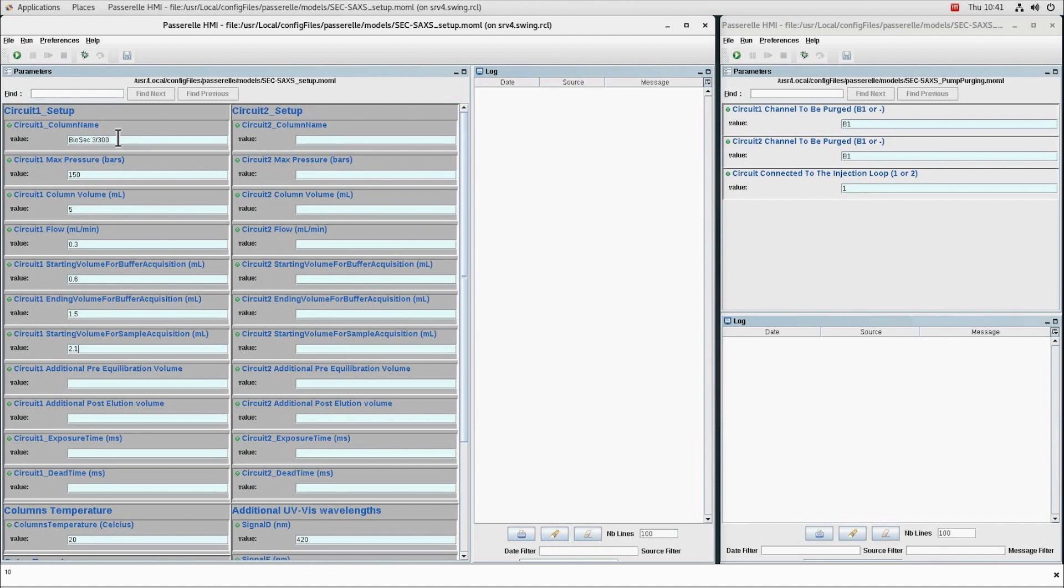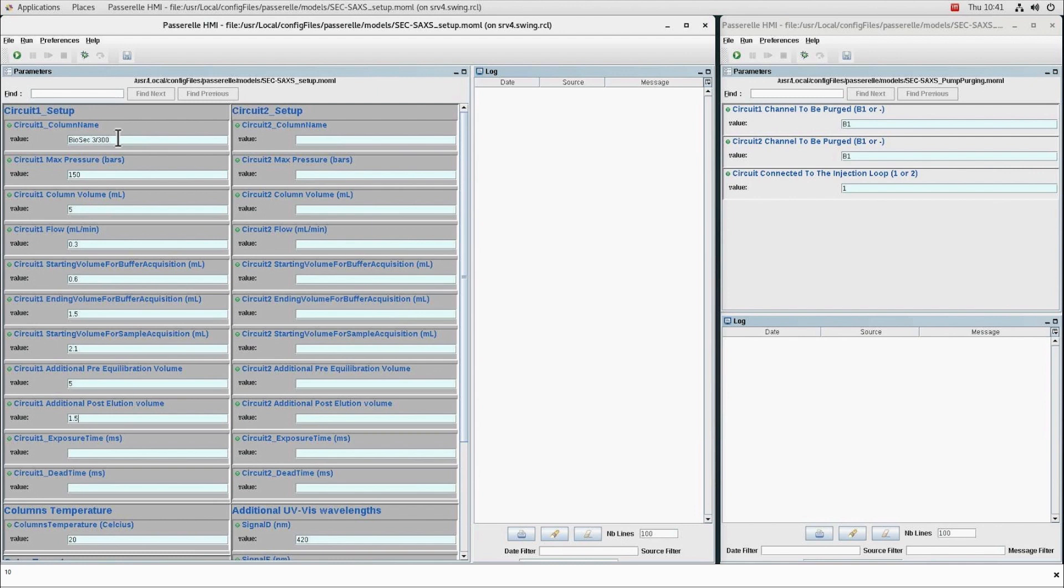And finally, an elution pre-equilibration time: an additional elution volume during which the elution continues without recording SAXS data. This is to ensure a stable baseline before the automatic injection of the next sample.